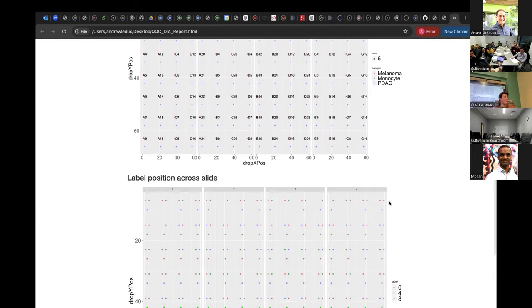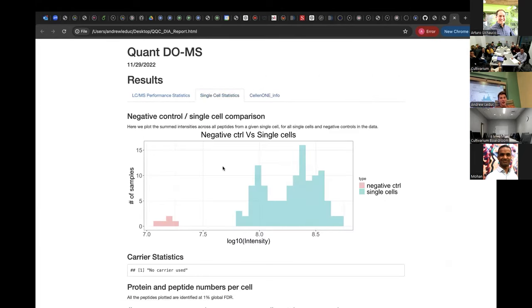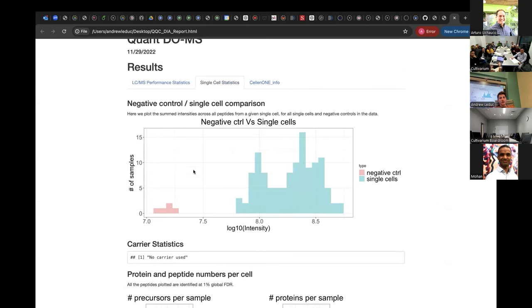It'd be nice to have that automatic annotation of your cell types. Maybe someone will come to that soon. So here are the more interesting statistics. We can look at our negative controls. It looks like the signal is about tenfold lower than our single cells here.